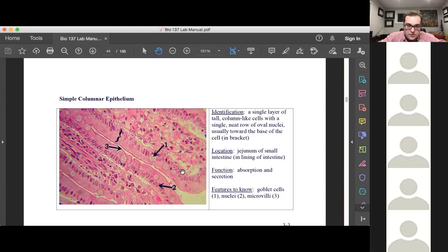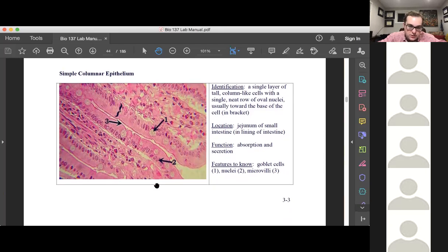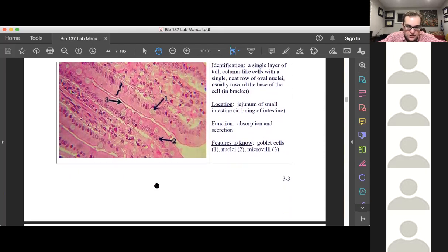Back on the microvilli, it's the same idea here. They all work together to bring electrolytes or nutrients or sugars, proteins, anything that the body may need, so it can come in contact with the cell surface and be absorbed into the GI tract. All right, so number one, two, three, simple columnar epithelium. Make sure we understand where we can identify microvilli, the goblet cell, and of course the nuclei. There are going to be questions on the nuclei.